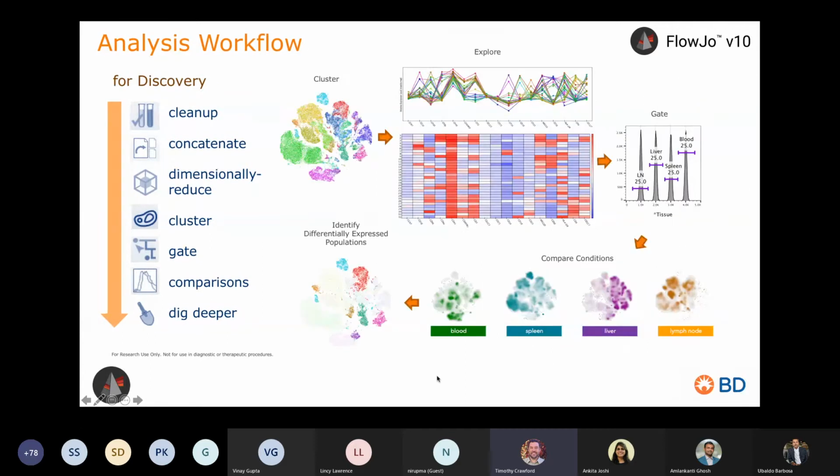So in terms of clustering, we have a number of different algorithms that subset or classify these events into distinct populations. And you can visualize those by overlaying the clusters onto your T-SNE space. And then as we've gone through here, with Cluster Explorer, you can get out the median values for all of the clusters for each channel, for each measured parameter, and visualize that, pull out the statistics, or copy this image over for presentation.